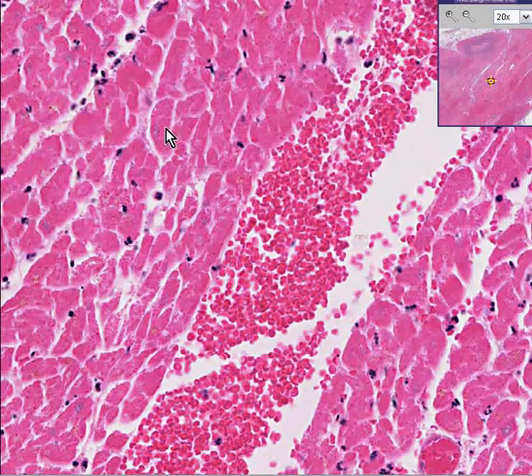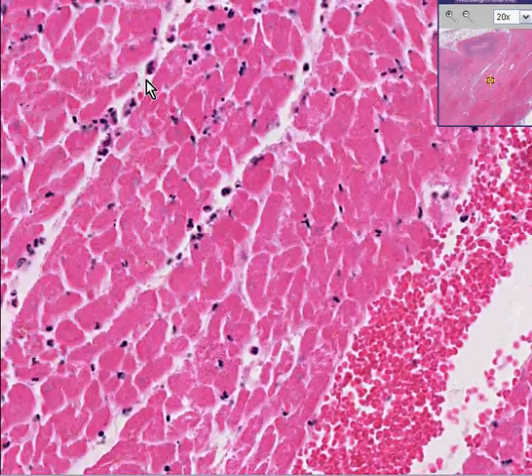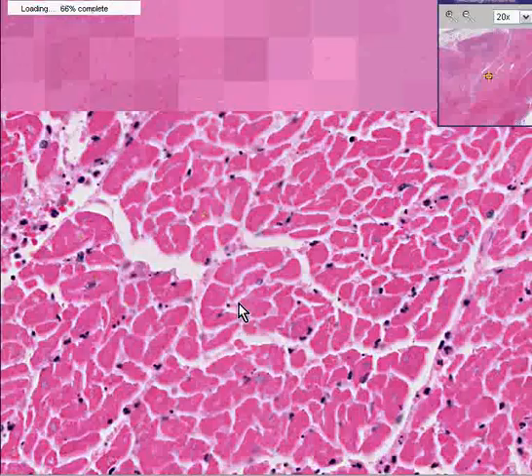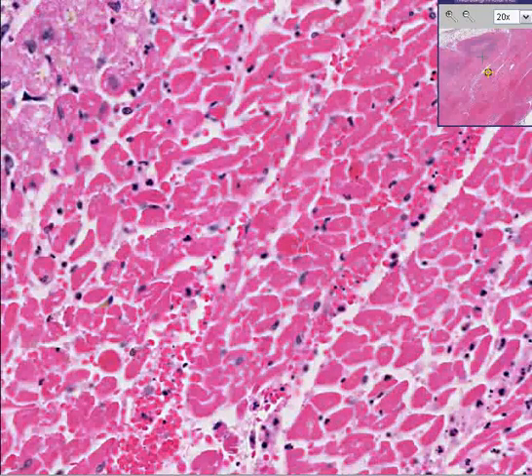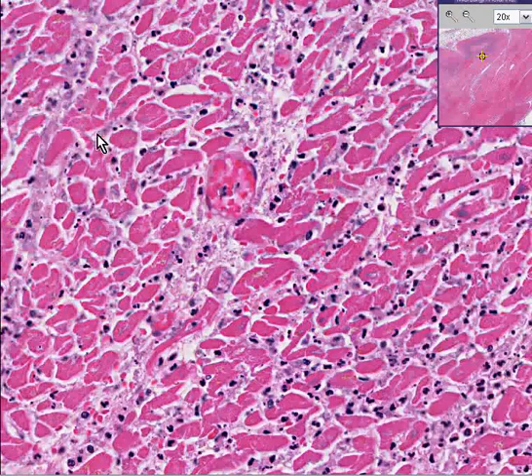This is an infarcted myocardium, and it's an acutely infarcted myocardium because if you look in some of the areas, you can see very heavy infiltrates of neutrophils now. So let's put this whole case together. We have an infarct of the kidney.